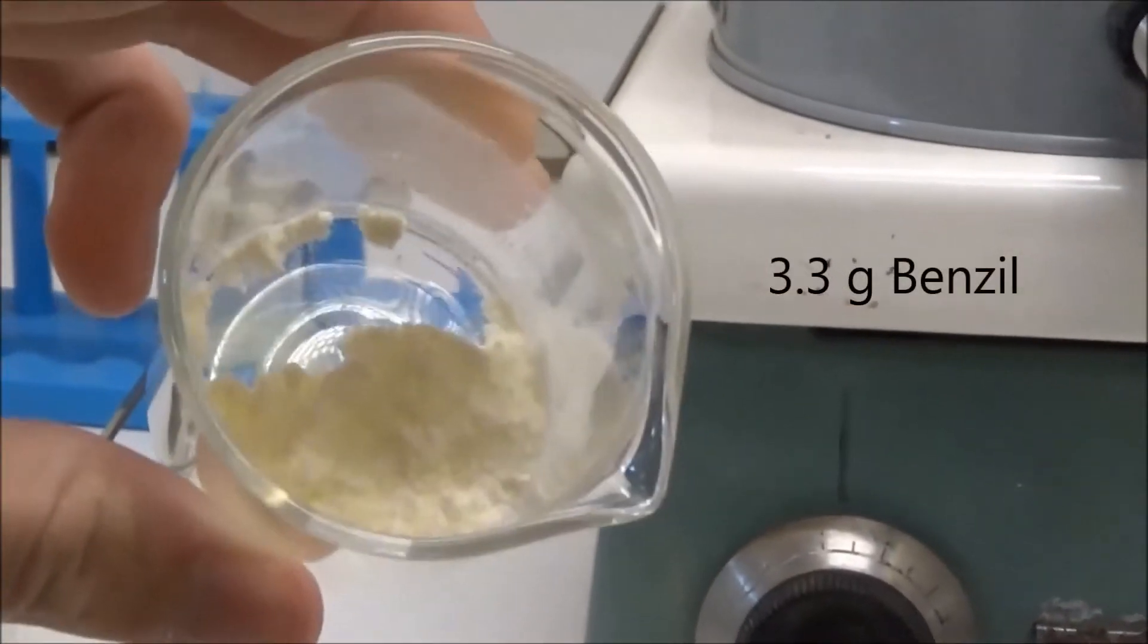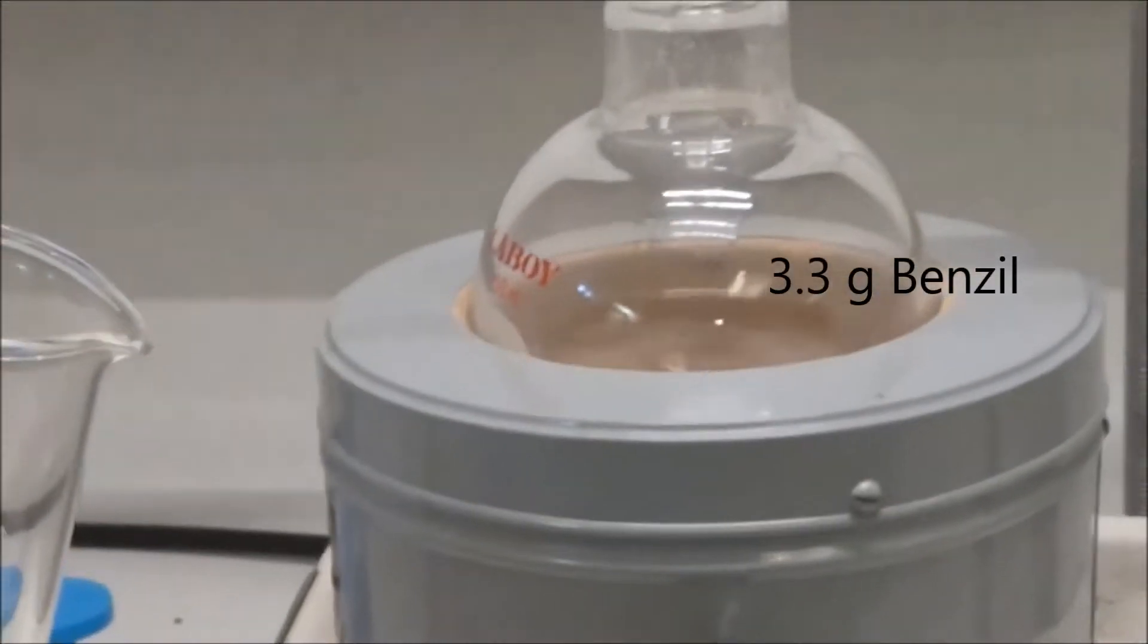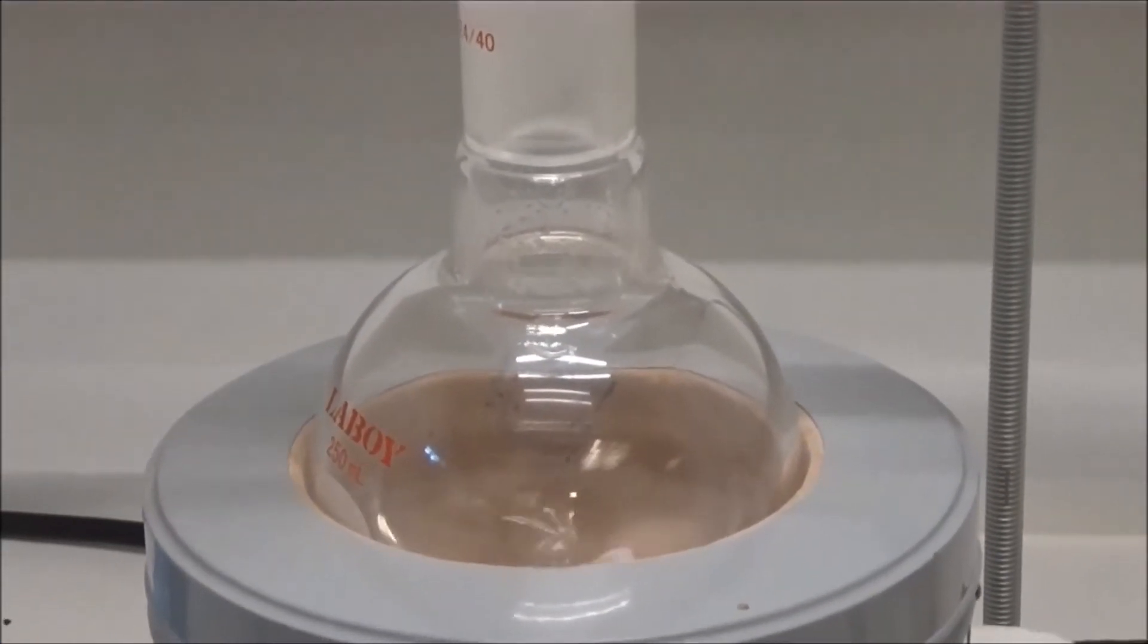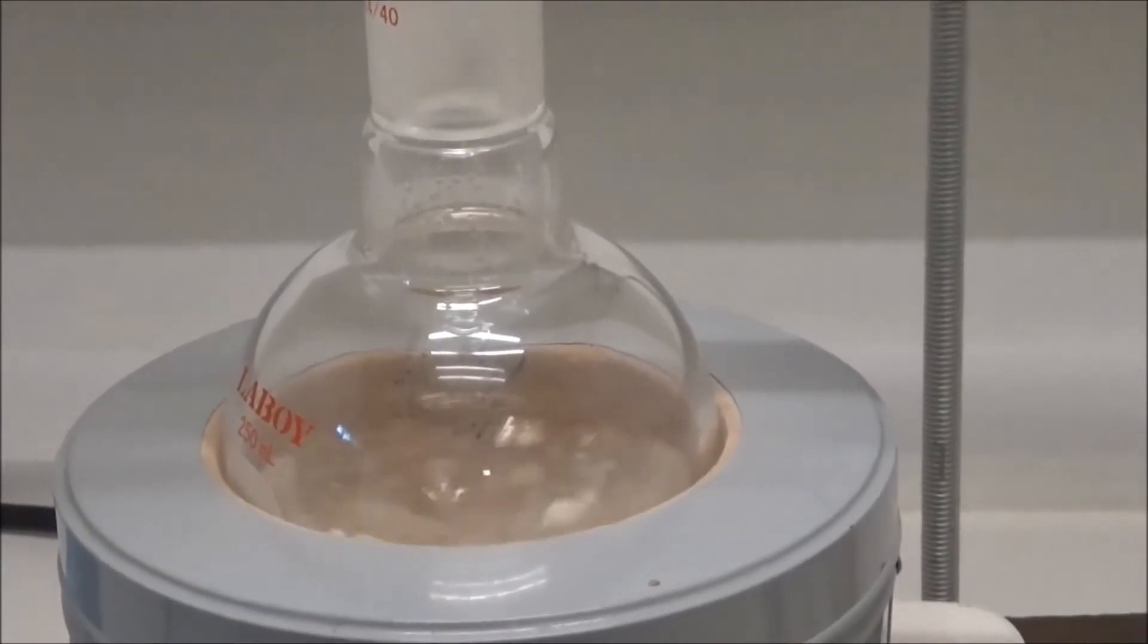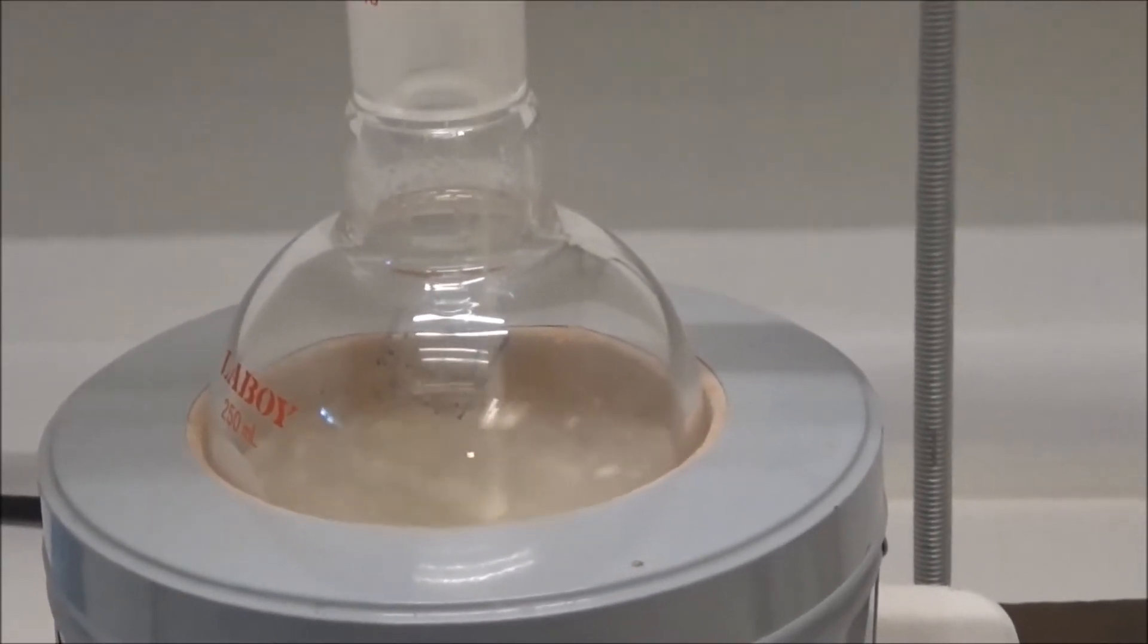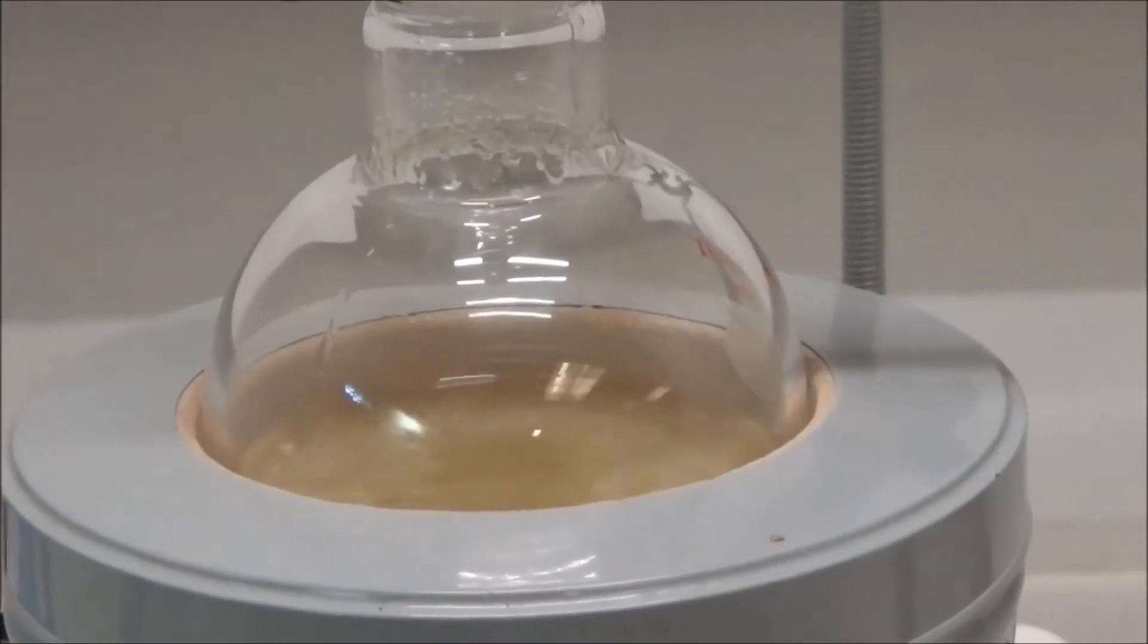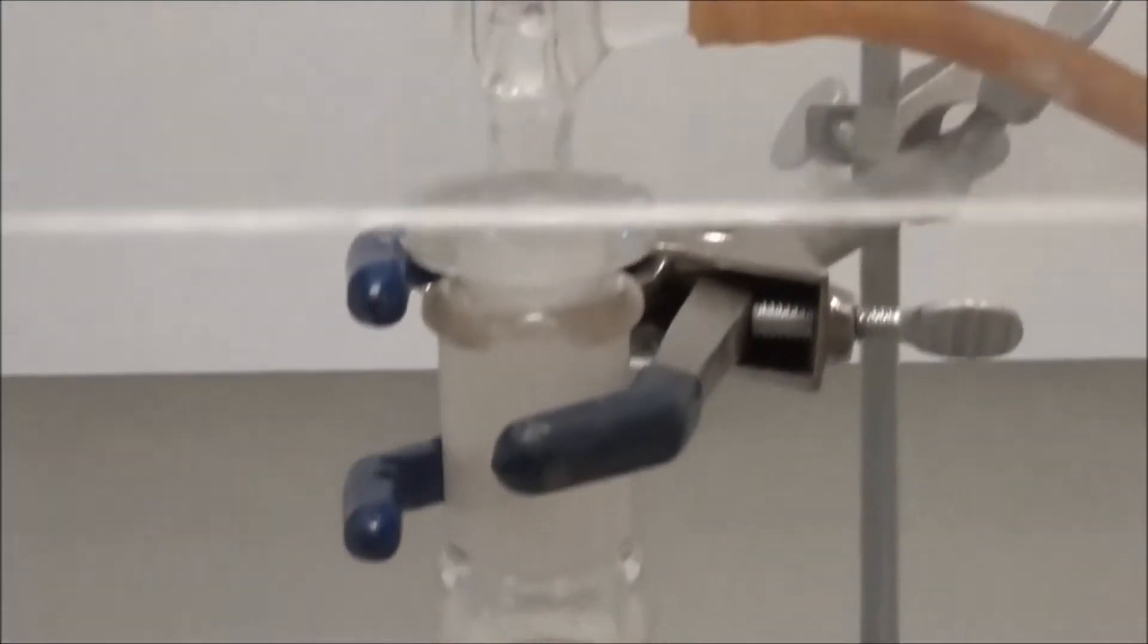I next added 3.3 grams of benzil. This was followed by 1 milliliter of benzaldehyde. I attached a reflux condenser above the flask and heated the contents to boiling.